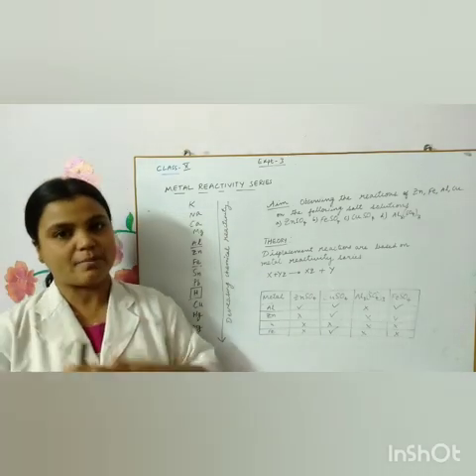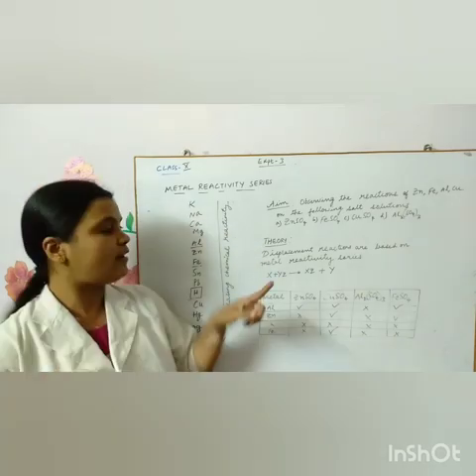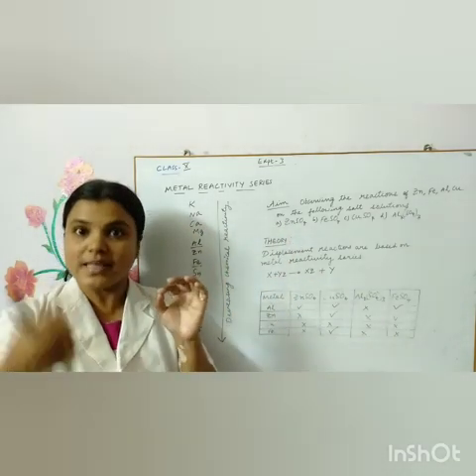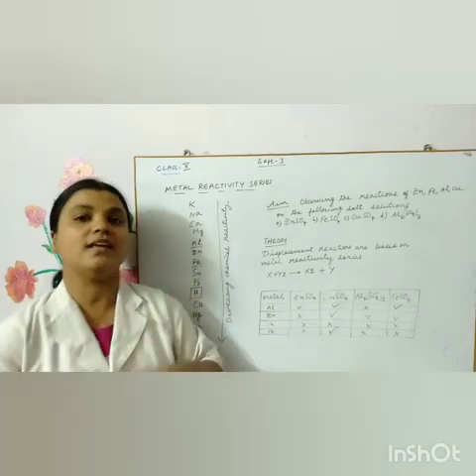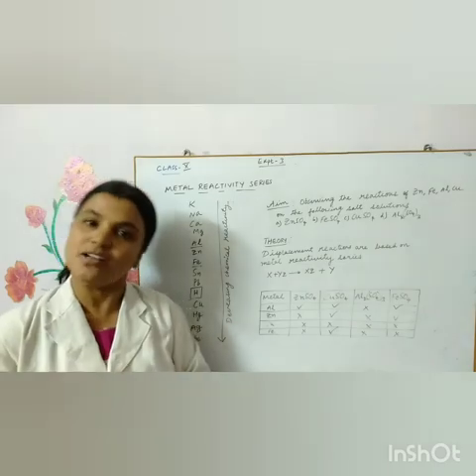If the reaction happens, you need to understand one thing here. If the reaction happens with aluminium, then we can say that aluminium is more reactive than the other metal in the salt solution.